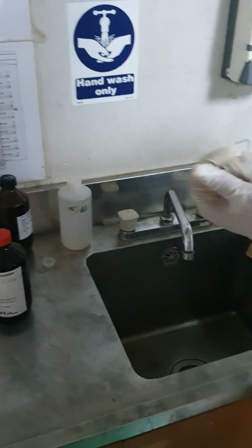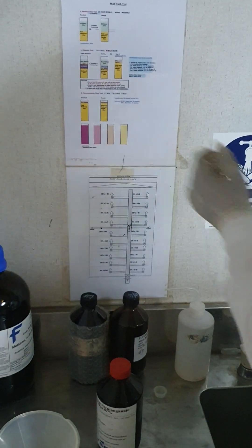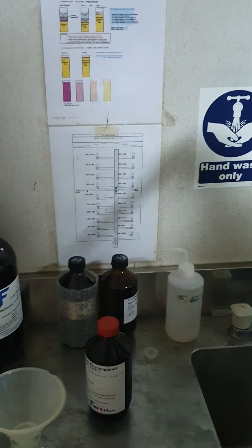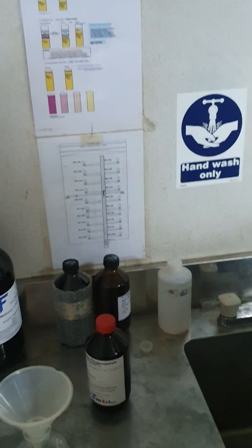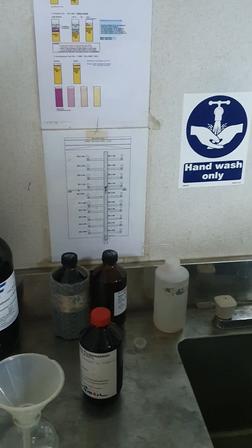That means some of the particular is remaining on the tanks. So make sure initially, whenever you are washing, going for this PTT time test, it is very difficult to pass the tank.